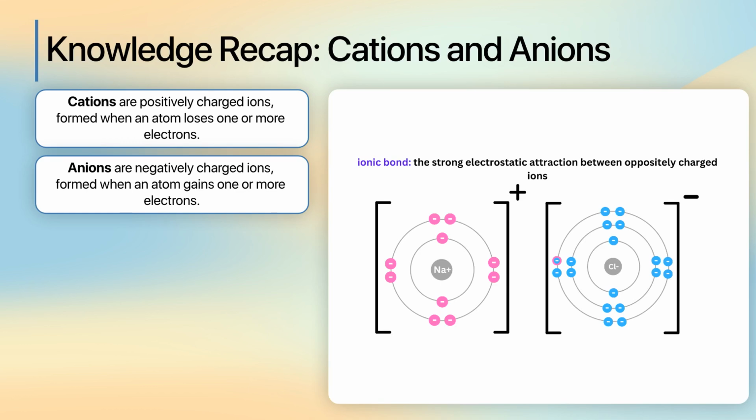We will explore how to test and identify these ions in compounds through various techniques to deepen our understanding of their properties and behaviors. By learning these identification methods, you'll gain essential skills in chemical analysis, allowing you to determine the composition of unknown substances accurately.